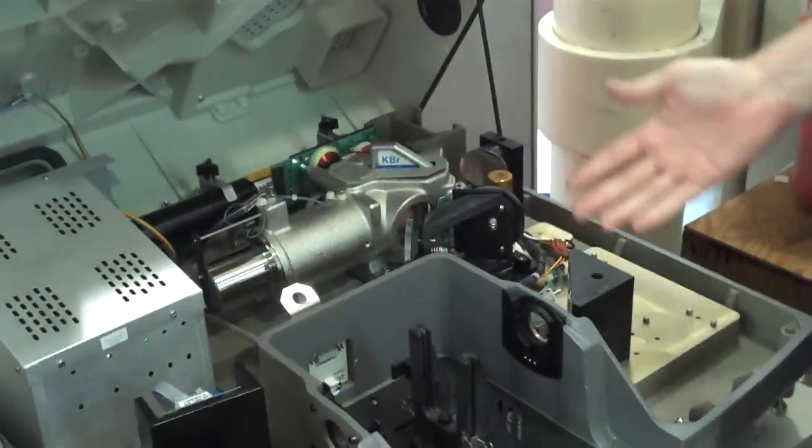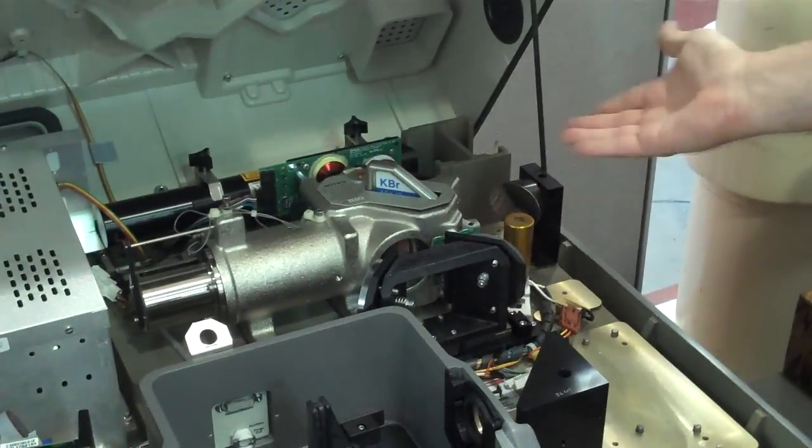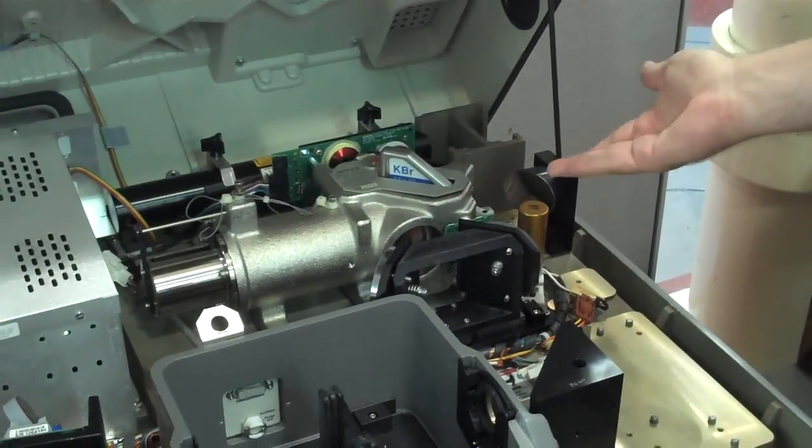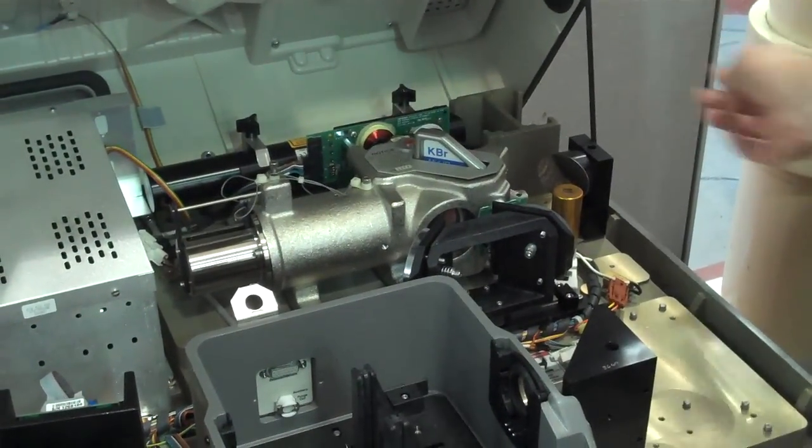If you look here, the basics of the spectrometer is really fairly simple. There's an infrared source, or in our case, we usually will put a synchrotron in on the side, but that's just a fancy light source that has much higher brightness.